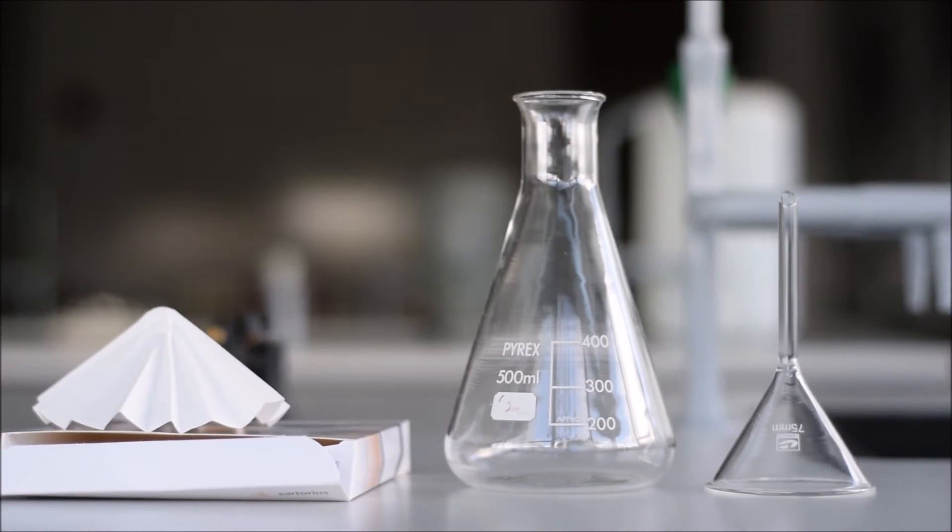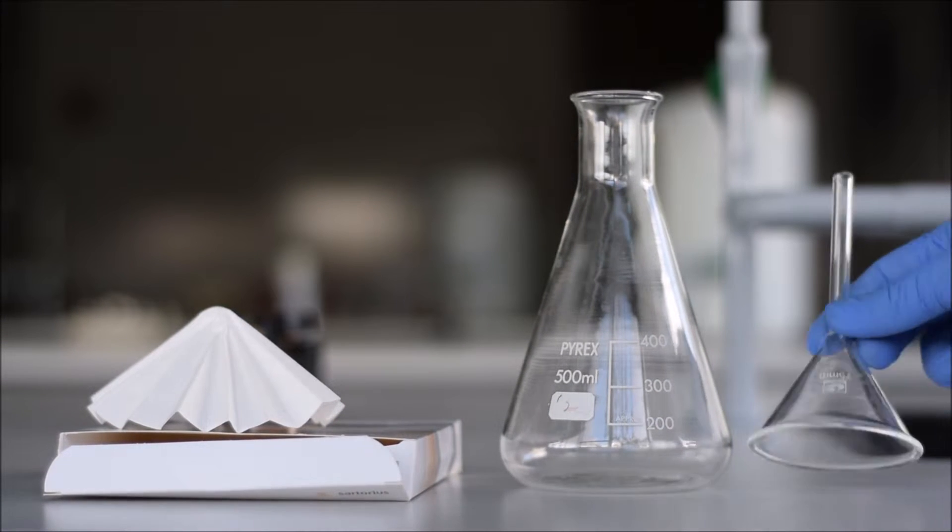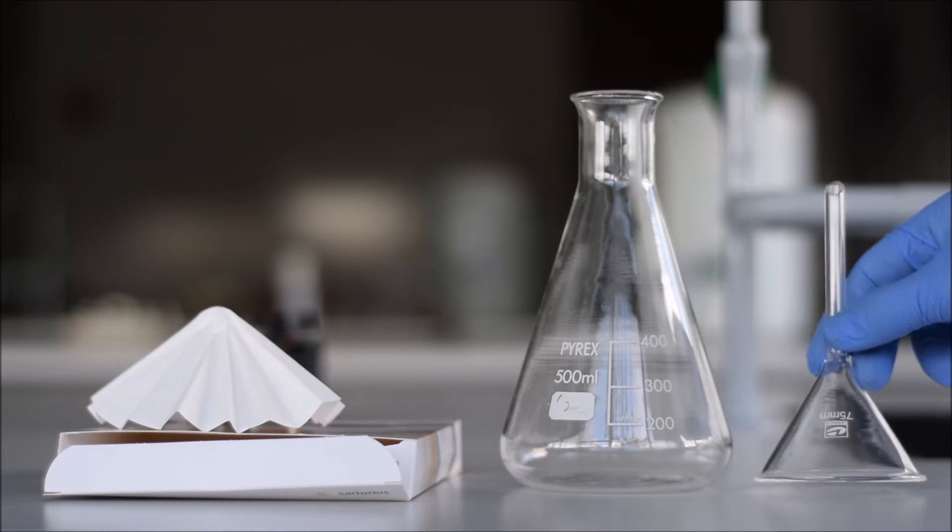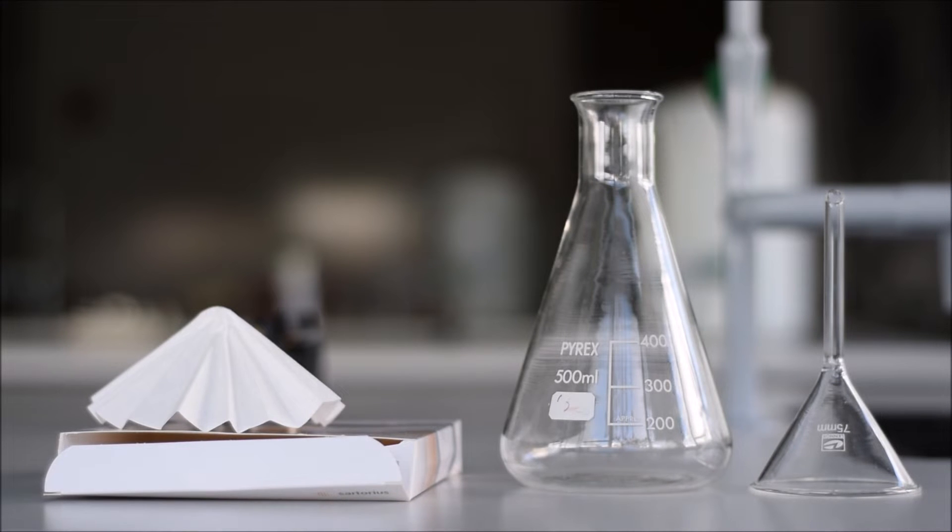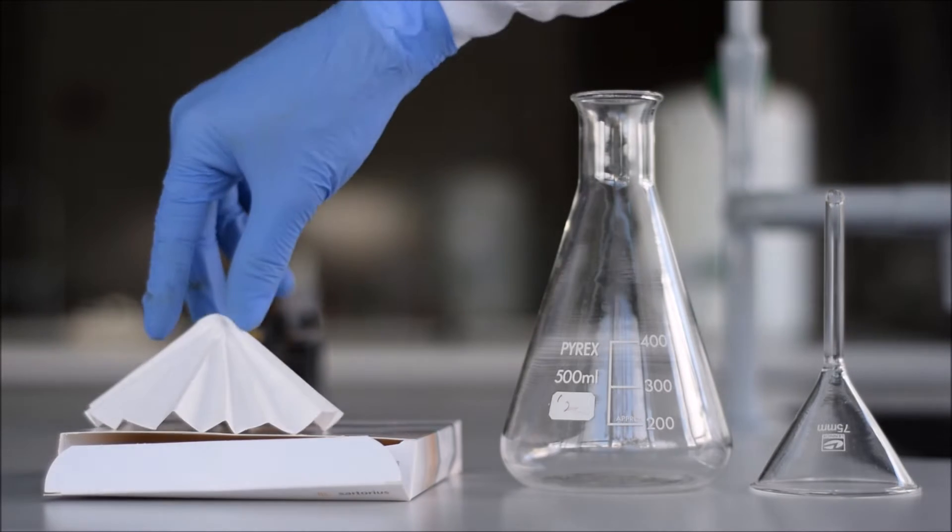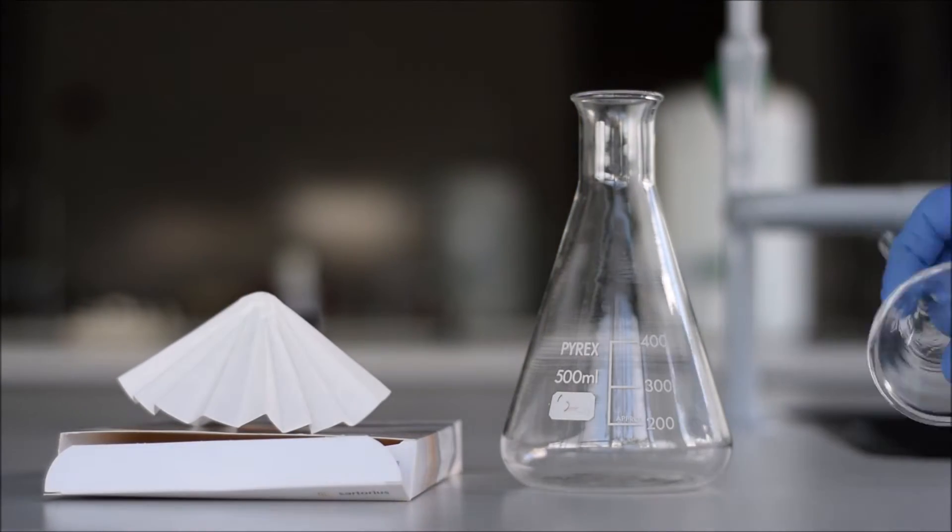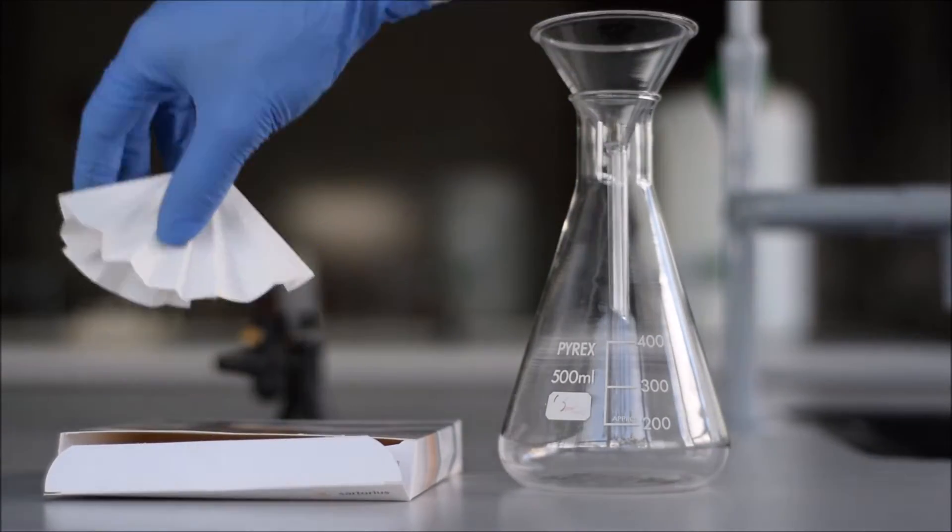The first and simplest one that almost everybody would recognize from the chemistry lab is a plain glass funnel. Into a plain glass funnel you put a neatly fluted filter paper, and the combination of those sits into the top of your conical flask and you pour the liquid through them. We'll come back to those in a sec.